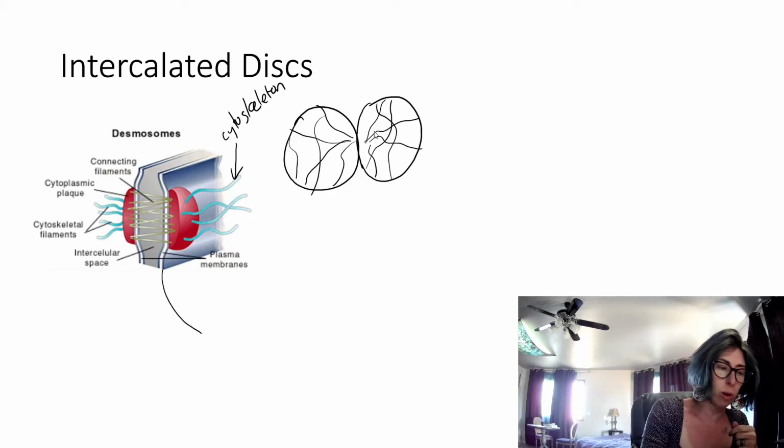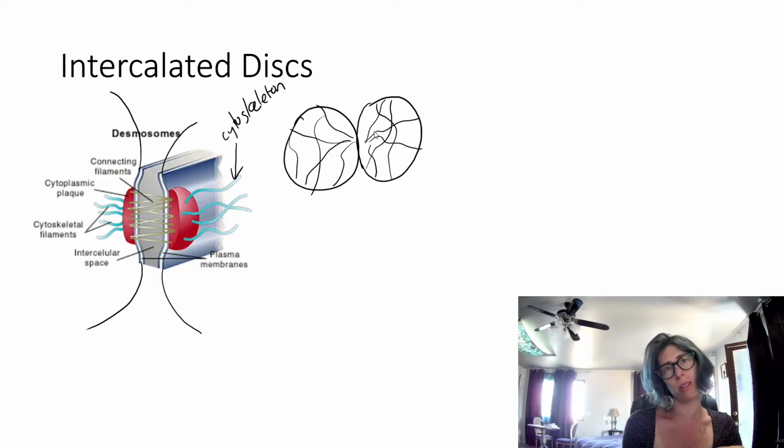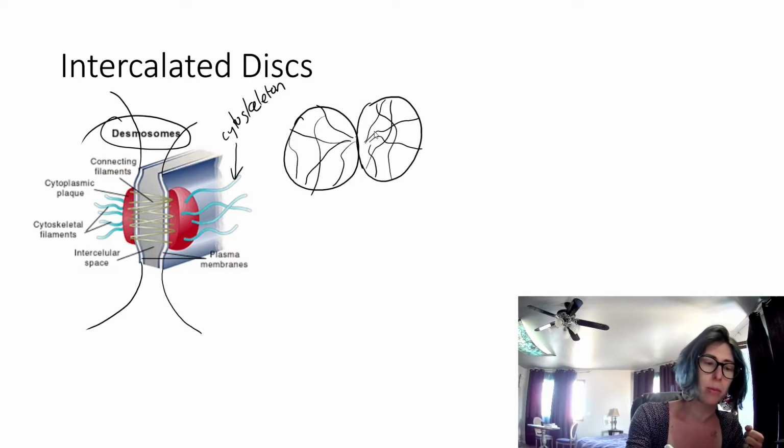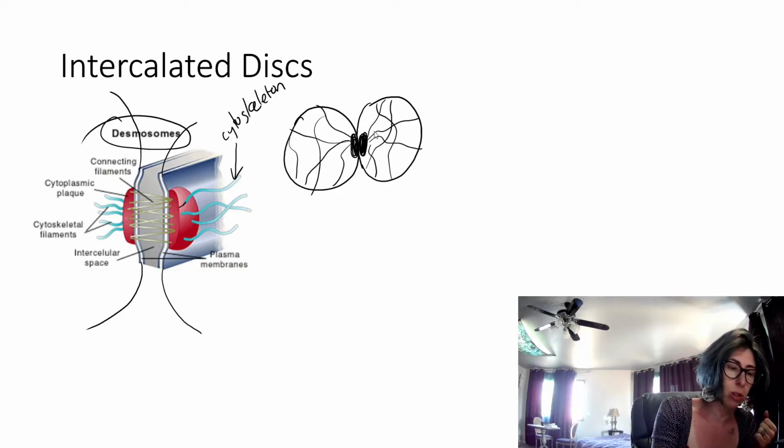This is the membrane of one cell, like my cell on the right, and this is the membrane of another cell, like my cell on the left. It's the phospholipid bilayer of the cell. Now, the desmosomes are attached to these cytoskeleton elements. And these are desmosomes, there's spellings right there. So you have these large, what's called plaques. So these like pads. The pads are attached to the blue cytoskeletal elements on one side.